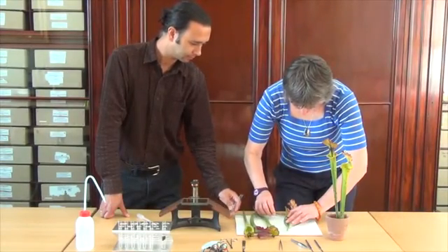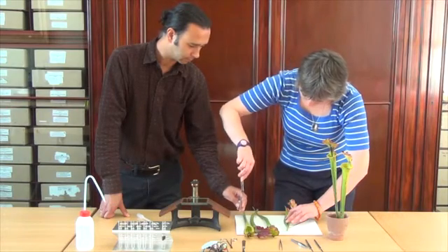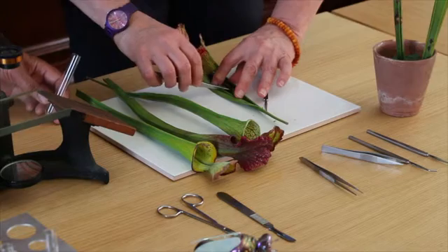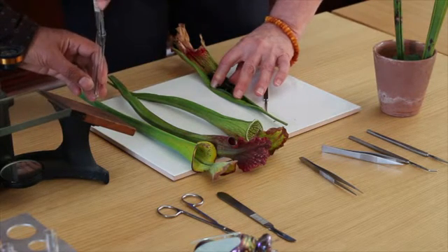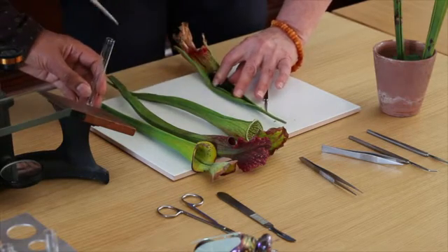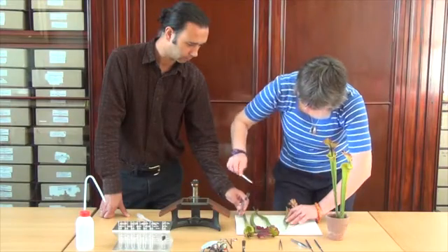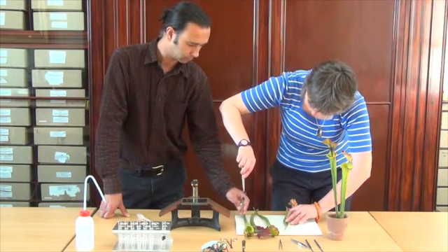Sometimes when I've done this, we've found a whole compound eye when we put them under the microscope, and jointed legs. And if you have the time and the patience, you can actually start to key out some of the insects that have been trapped by the plant.